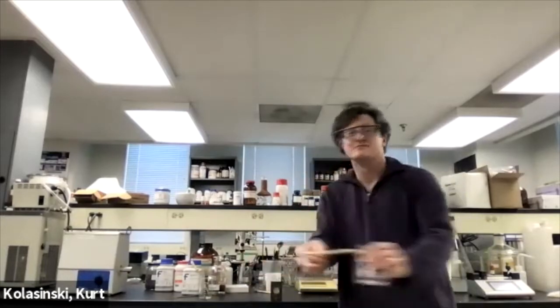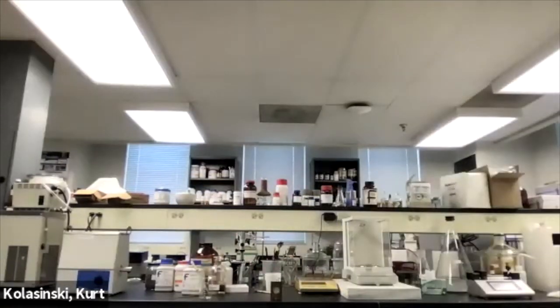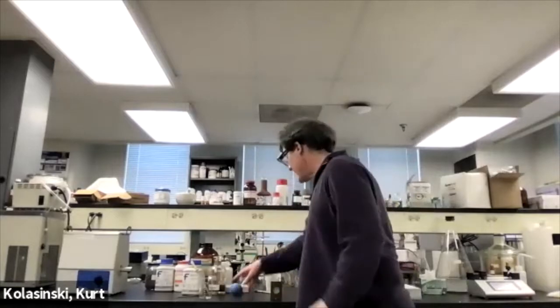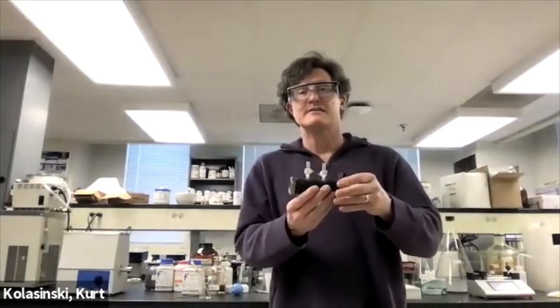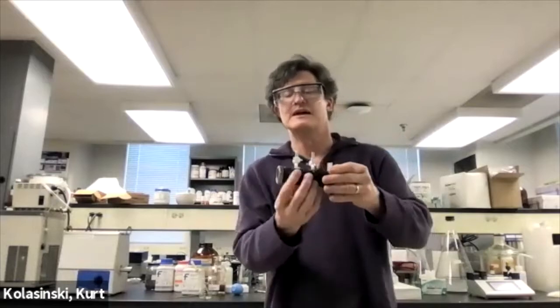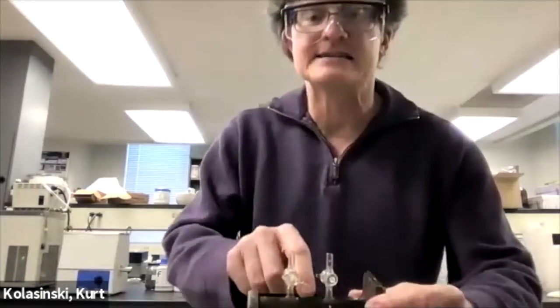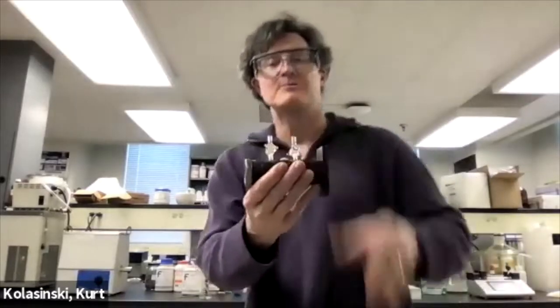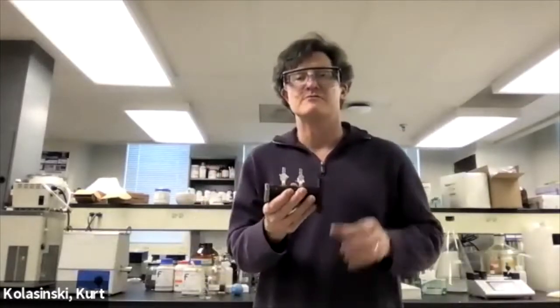I'm gonna stick this in the fume hood, so the rest of the HCl just goes out into the fume hood. All right, so now we've got our cell with a nice long path length with some HCl in there. We'll see if it's enough in a moment. Got our salt windows that we keep our hands off of, right? We're allowed to touch this. There's a glass container in here. That's what those are attached to, right? That's on the side. So we just keep our hands on the side.